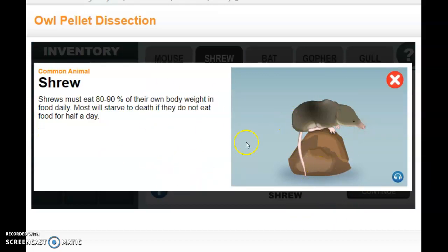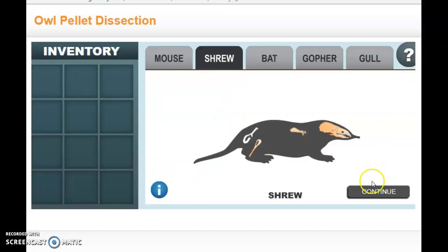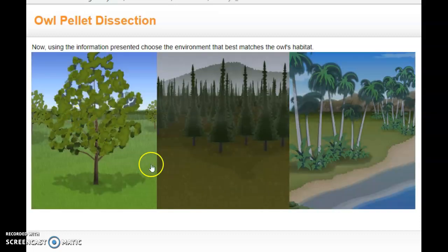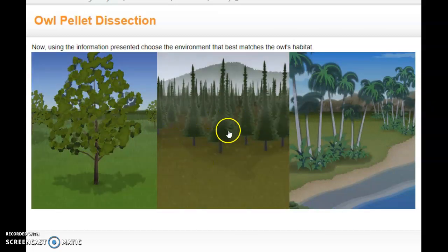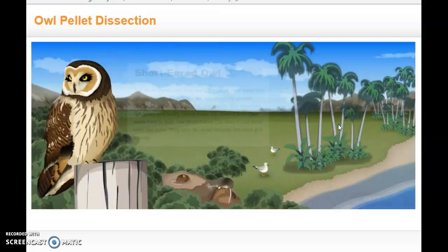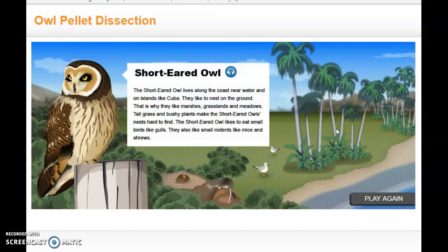Now that I've found all the animals these bones belong to, I need to figure out which environment the owl lives in. There's an open field, a forest, and a coast. Based on that seagull, I'm going to guess this owl probably lives along the coast and was hunting there — and that's correct. It is a short-eared owl, and it gives you more information on that.